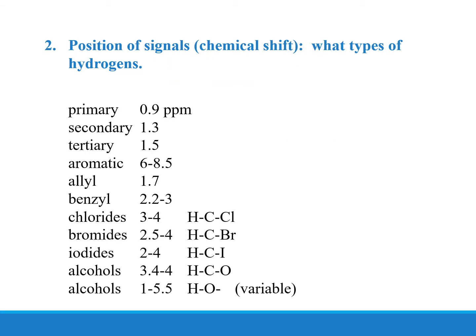So in general, as we go from primary hydrogens to hydrogens bonded to electronegative atoms, the de-shielding increases.